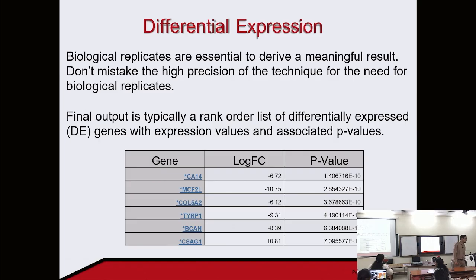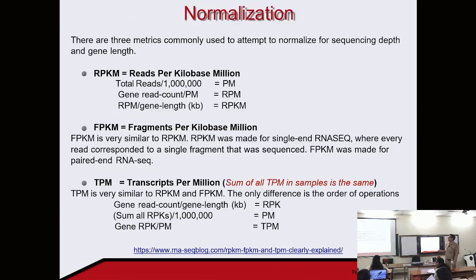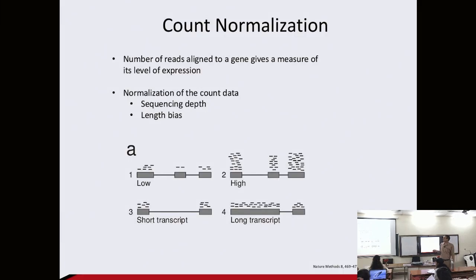Multiple reads in the same transcript. No. Why would you want to perform normalization of RNA read frequency?